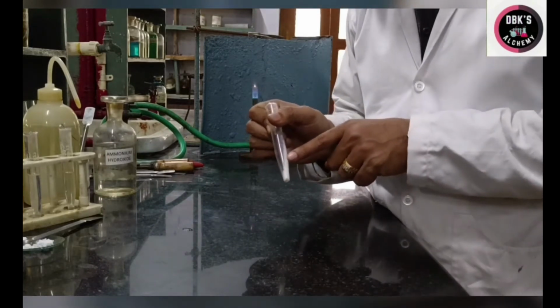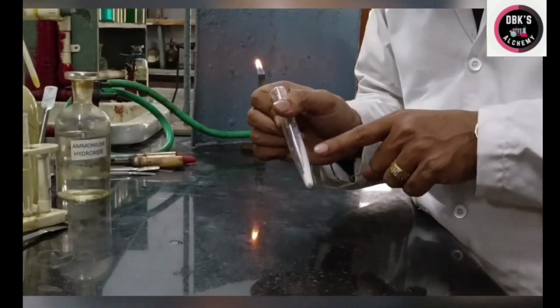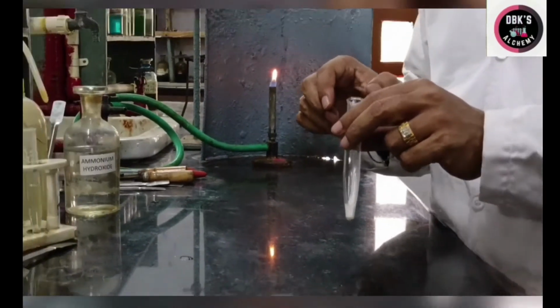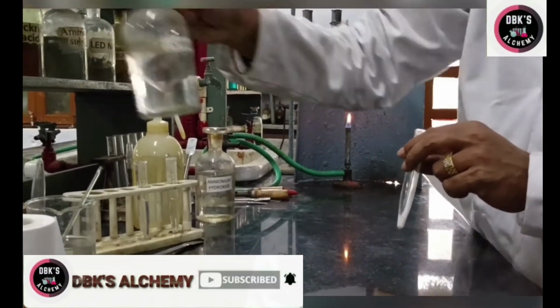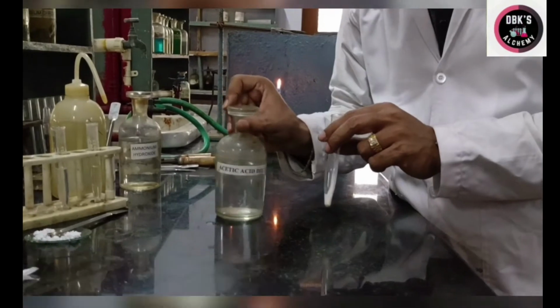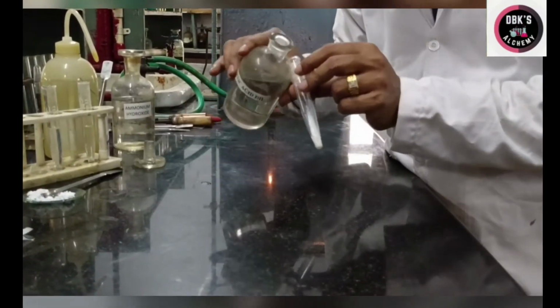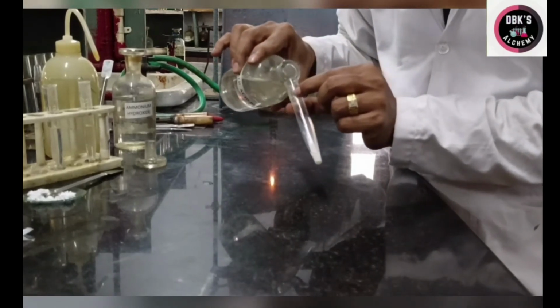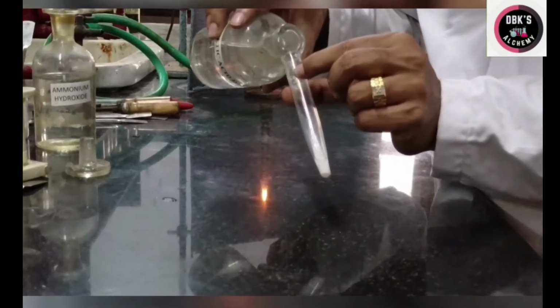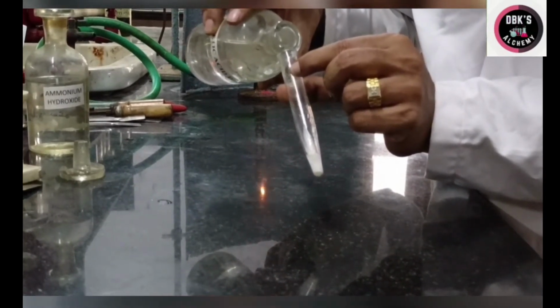So to this residue, I am adding dilute acetic acid and potassium chromate. Okay, so let me add dilute acetic acid and potassium chromate. So this is dilute acetic acid. I am adding dilute acetic acid. So I have added few drops of dilute acetic acid.